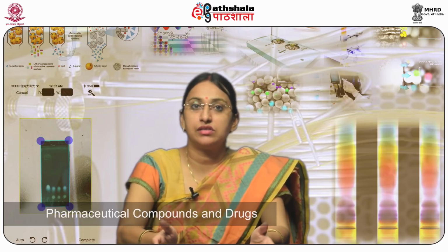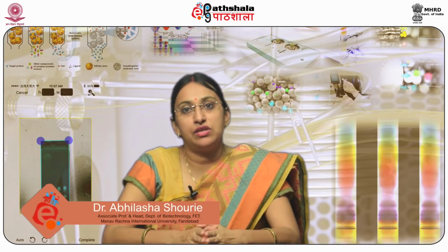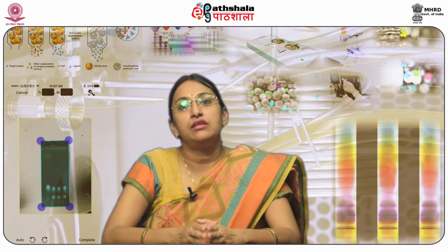So students, let us now summarize what we have learned in this module. Method development and validation are key elements for any analytical process. It is essential to establish the identity, purity, physical characteristics, and potency of the chemicals, pharmaceutical compounds and drugs. It supports drug testing against specifications during manufacturing, their quality assurance and stability. Validation proves the scientific soundness of the process, measurement and characterization.